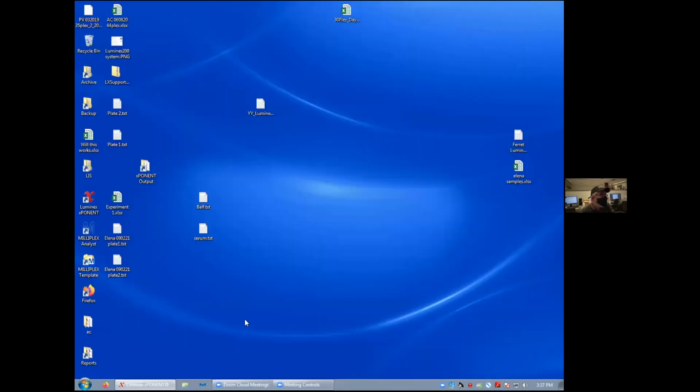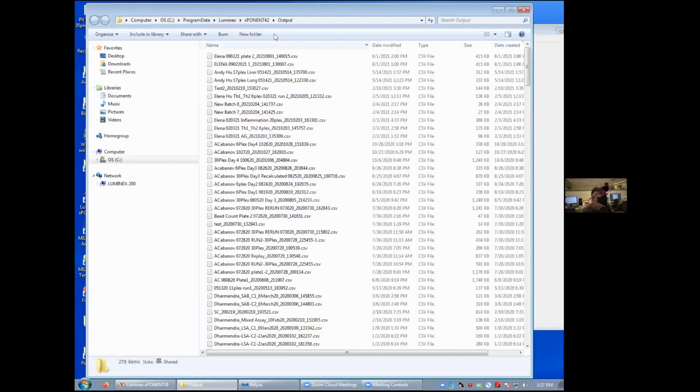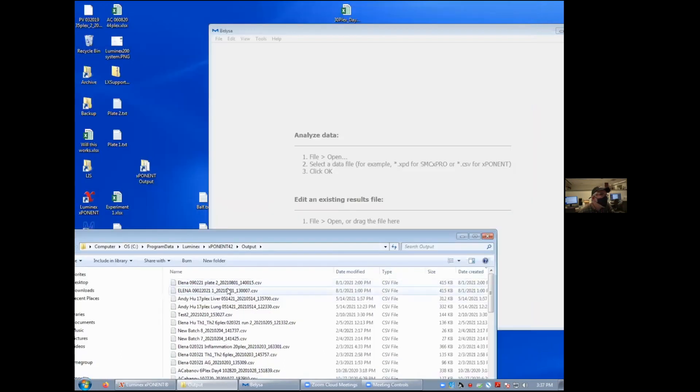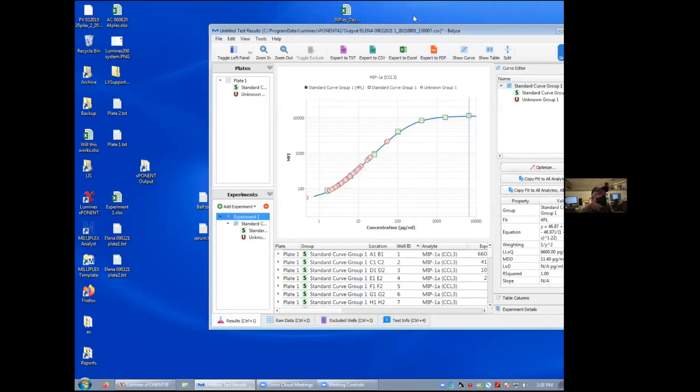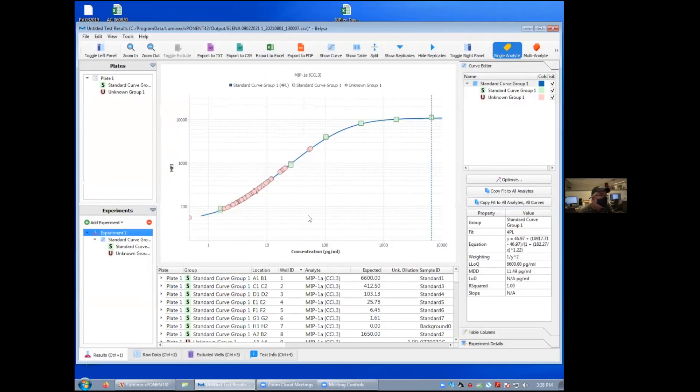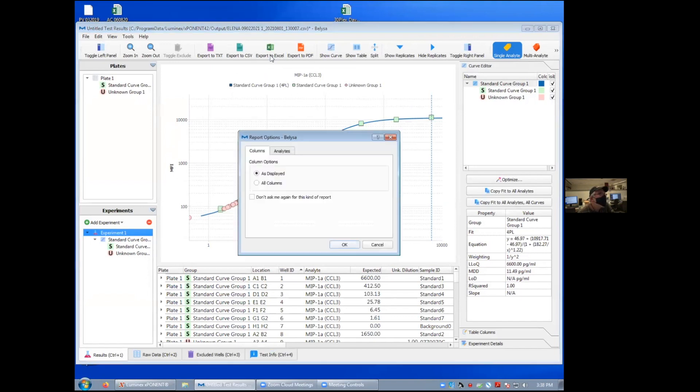To analyze your data, we're going to use the Belysa software. And all you really need to do is simply find your data file and dump it right into this software. It will automatically calculate the standard curve for each of the analytes and the concentration for each of your samples. From there, you can simply export the data as an Excel spreadsheet and proceed with your analysis any way you want.